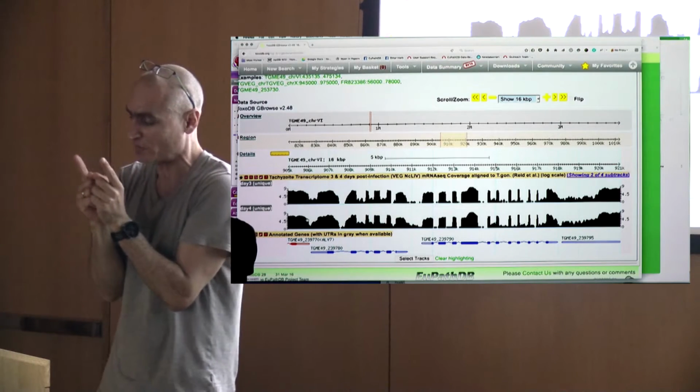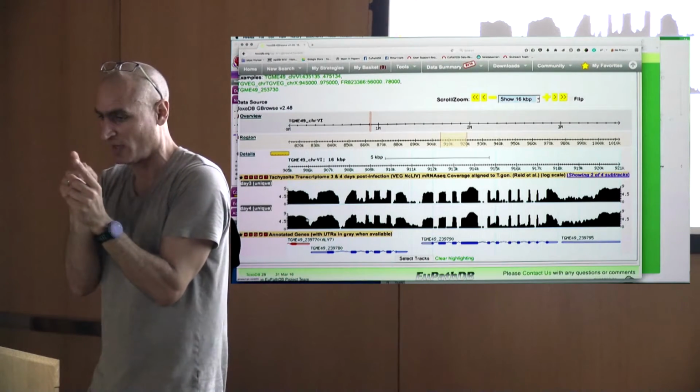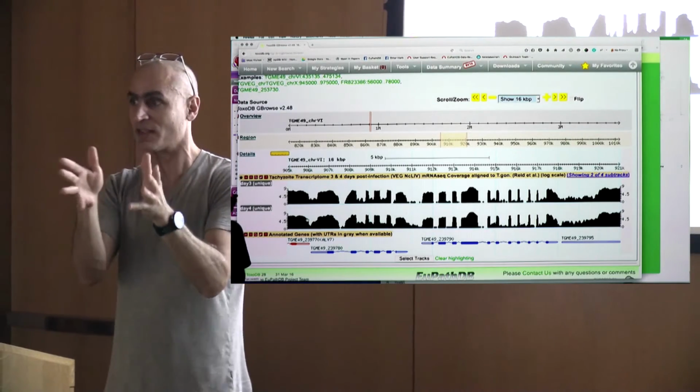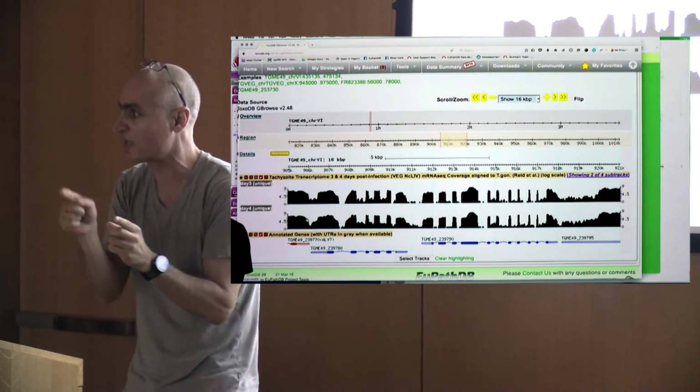Obviously, you can do it manually. You can go into each one of these, look at the sequence and say, okay, there's an A, a T, a G, a C. Now I'm going to go to my genome, my millions of nucleotides, and look for that same sequence.